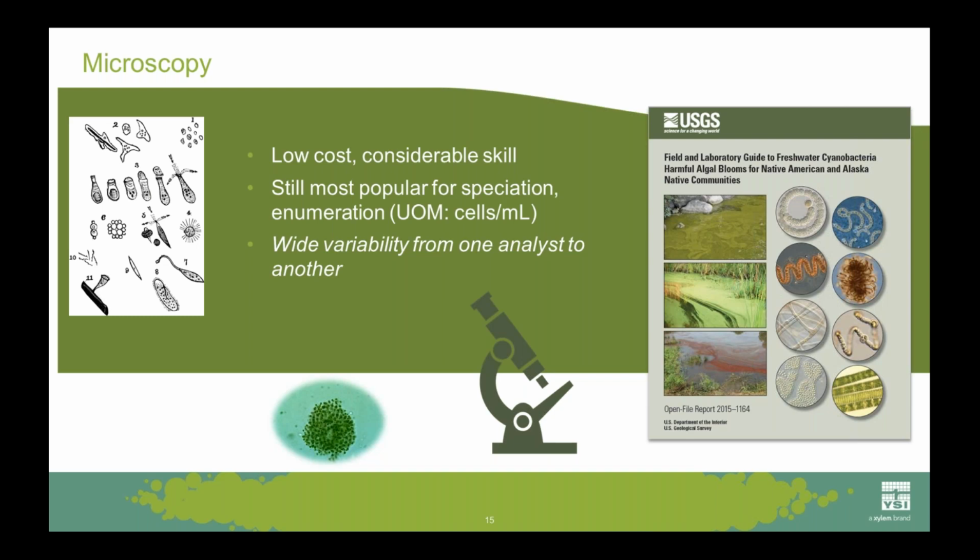But I always warn users that there can be a wide variability in the enumeration of algae populations using a microscope because analysts often categorize the algae just slightly differently. So having a good species key and standard procedures is really, really important if you're using microscopy.